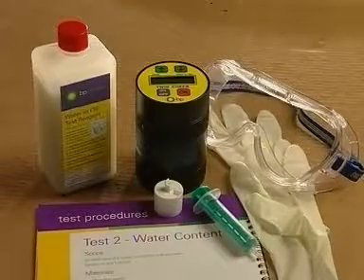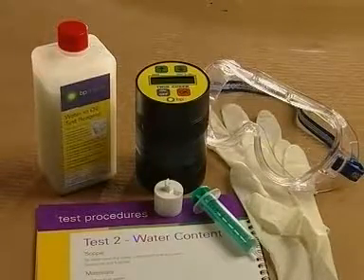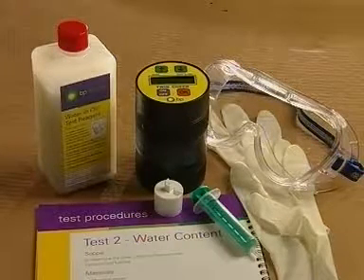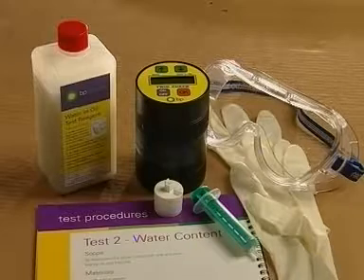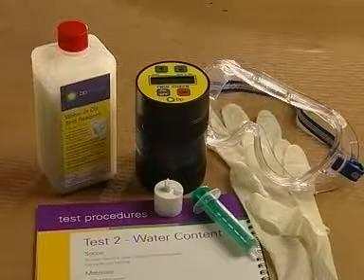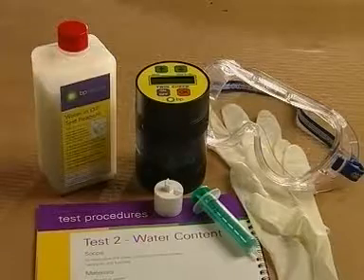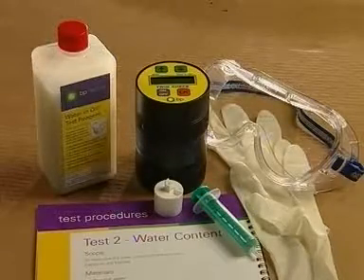You will need a reaction vessel, a 10 milliliter syringe, 500 milliliters water in oil test reagent, eye protectors, and protective gloves. The glasses and gloves used in this demonstration may not be those supplied with the test kit.